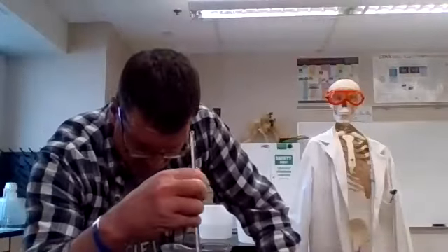Okay, here's our cold beaker of methanol. It's an alcohol, so it has a freezing point well below 0, so we can keep it in the freezer and use it for exciting experiments like this. I'm going to check the temperature here.